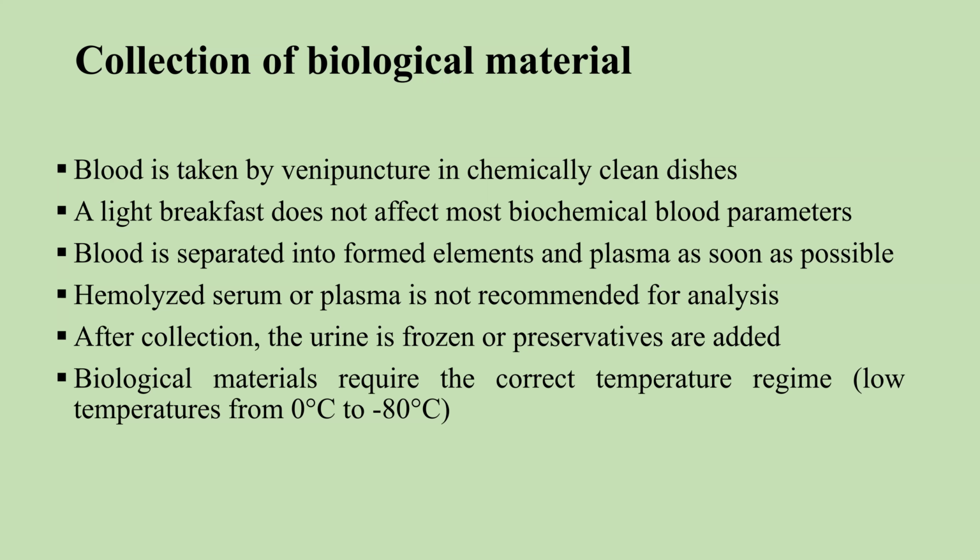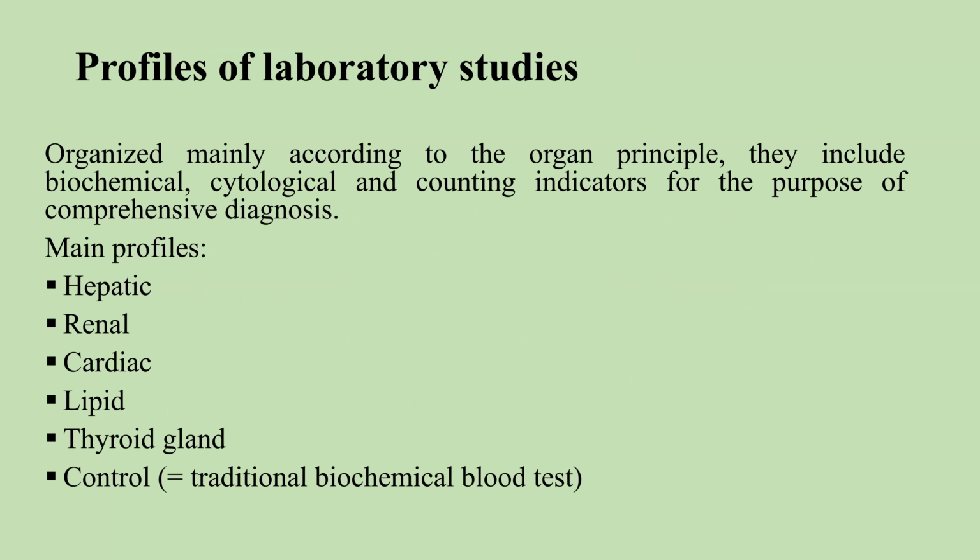Sterilize material for this procedure, remove some biospecimens like hemolyzed serum or plasma from the evaluation, and keep the correct temperature regime, which depends on the material.